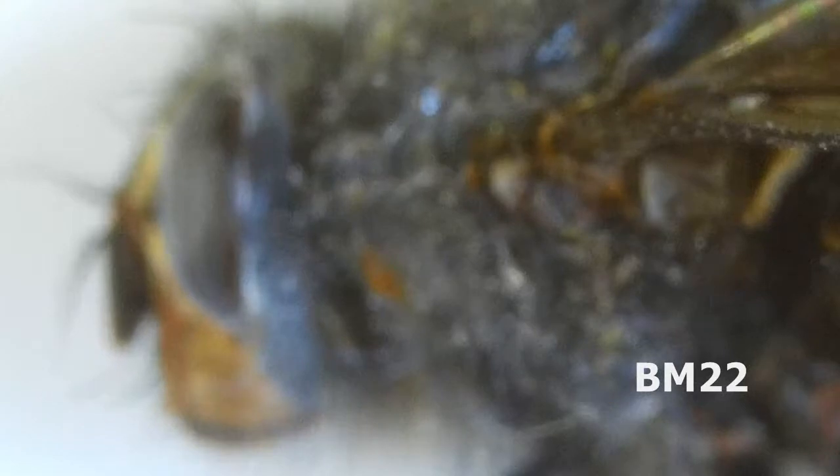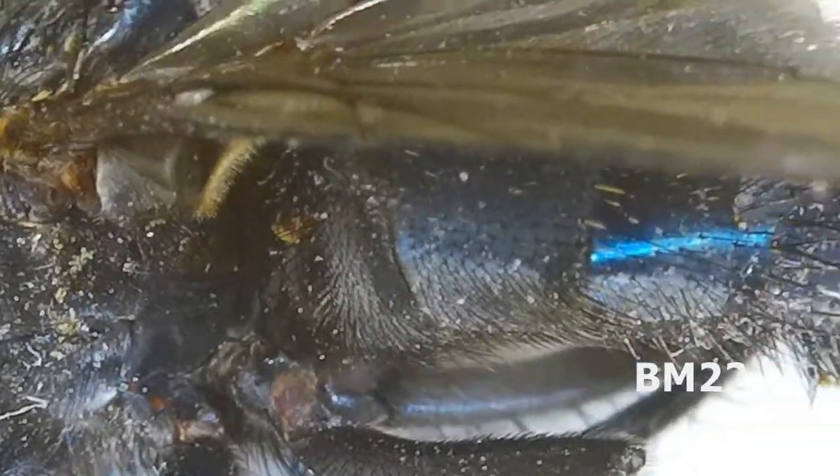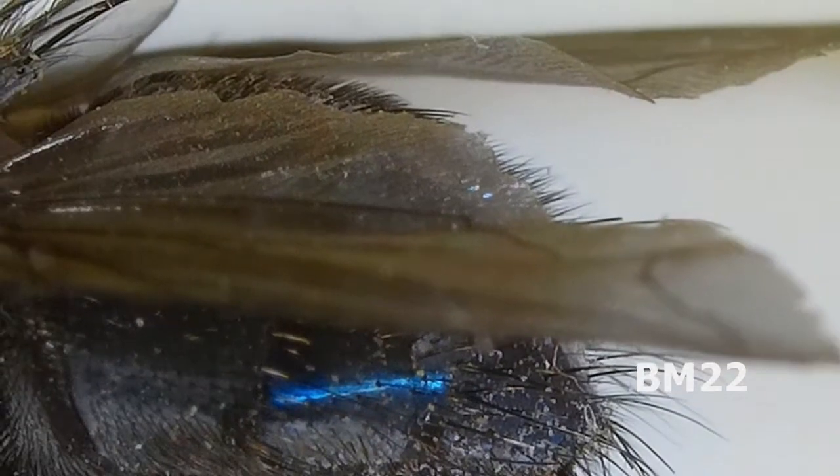And then we can film them. But yeah, this is just horrible. You can see the dust on this fly. They are horrible. I don't even know why we're doing this. You look at it up close and say, that's what a fly looks like. We know what a fly looks like. It's gross.